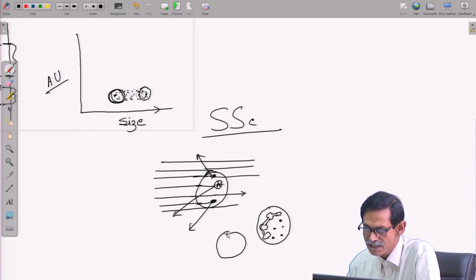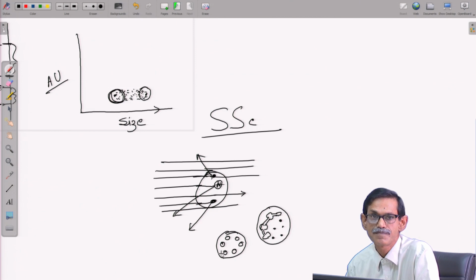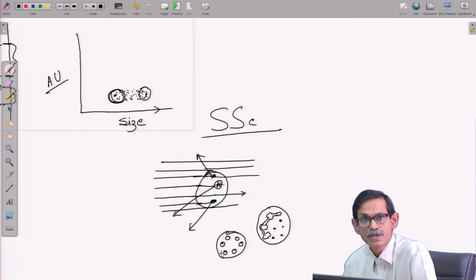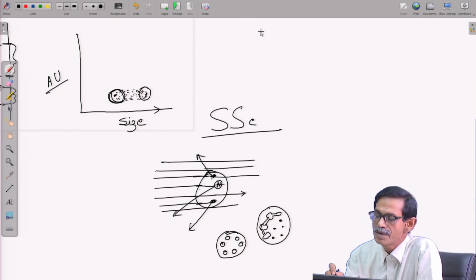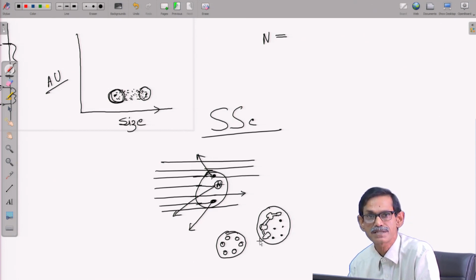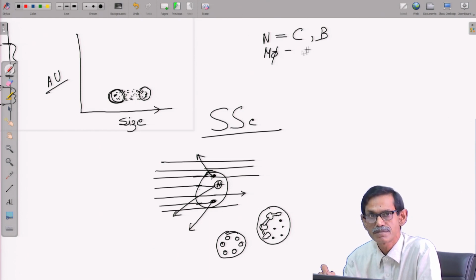And if you remember the mast cell, there are a lot of histamine granules inside. So, there are a lot of particles. If you see a lymphocyte, there are very few particles inside, right. Macrophage is bigger, but has fewer particles. Okay. So, now if I see the neutrophil, the granularity is much more. So, neutrophil is complex as well as big. Macrophage is not much complex, medium complexity, but big.